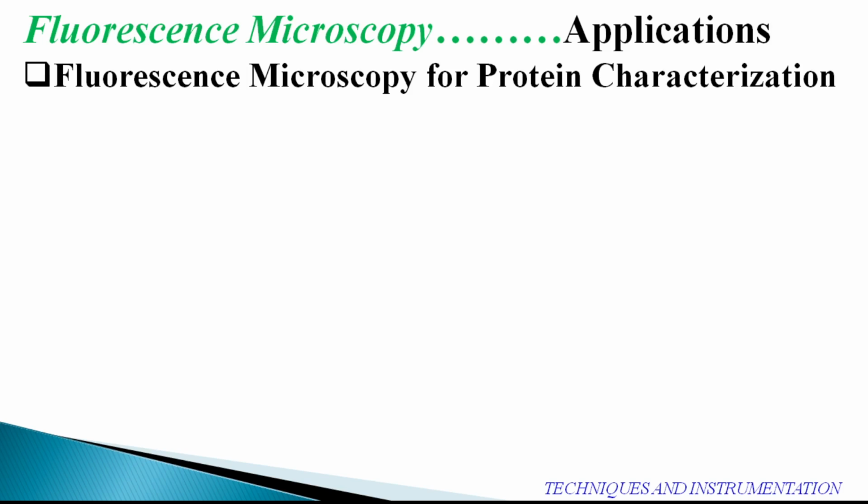Even that happens in the case of fluorescent microscopic instrumentation also. But as compared to some other sophisticated devices, fluorescence microscopy shows quite better detection and gives the best result.